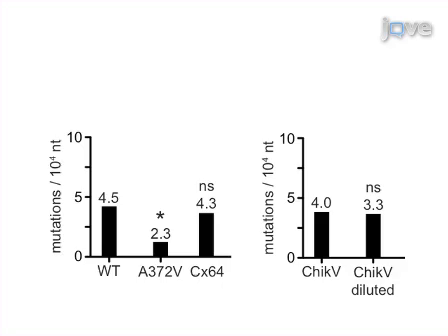The same chikungunya virus population gives similar mutation frequencies, whether the virus stock or a 10 to the 5-fold dilution is used for RNA extraction.